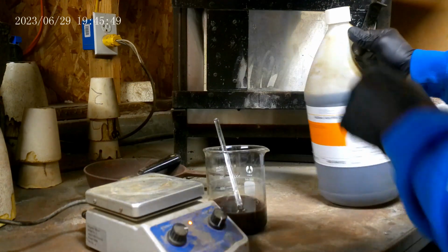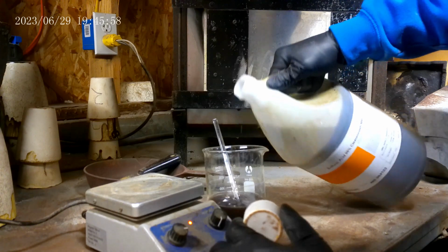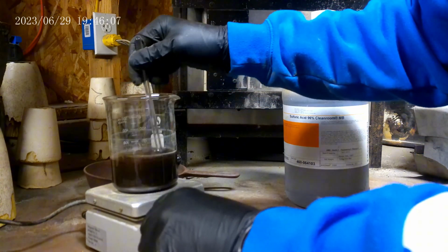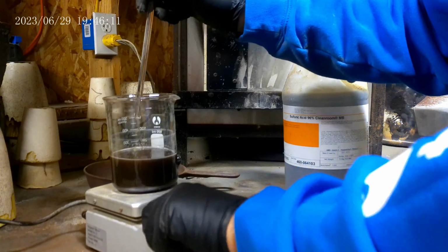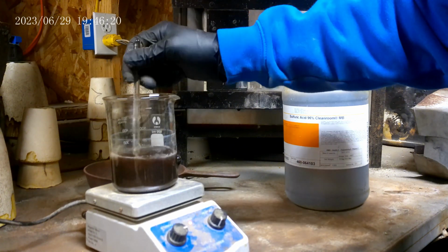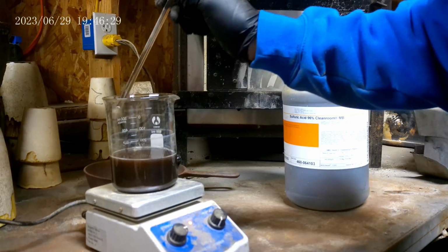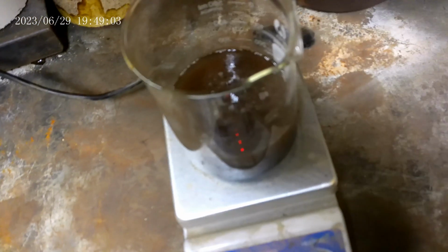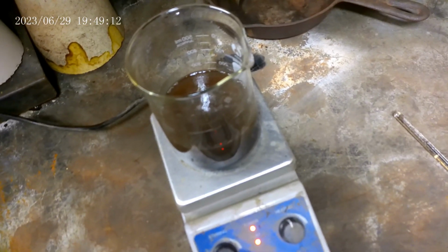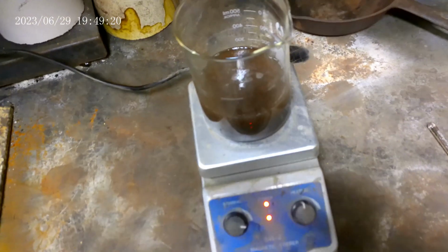We're going to put a little more acid in here, make it a little more fluid. All right, my stir doesn't want to work. I'll readjust this, get it going, and turn the camera back on. Well, for some reason, maybe too many magnetics in there, the stir won't work, but we got some heat on it here. We're going to let it sit for several hours today, and we'll filter out that water and try to smelt this stuff. Check back in later today.